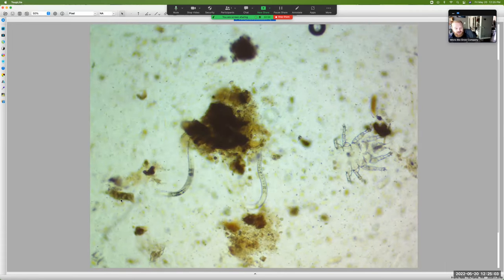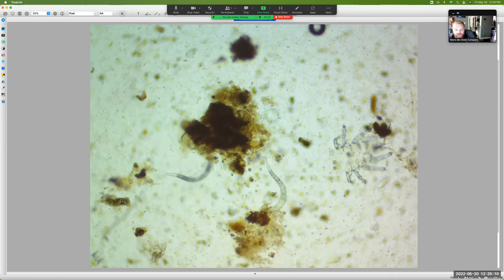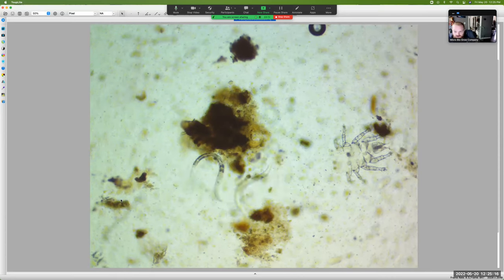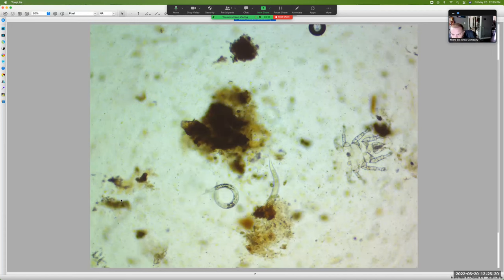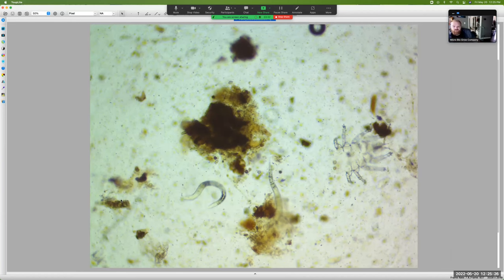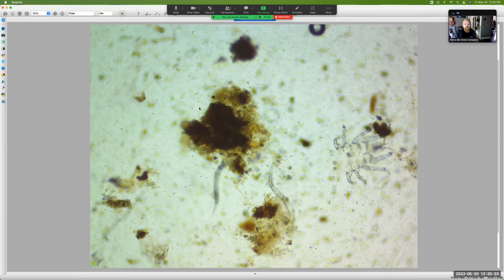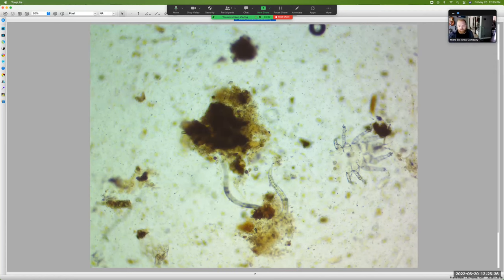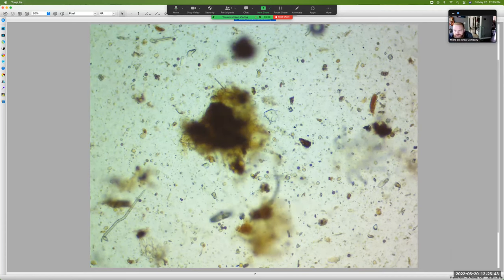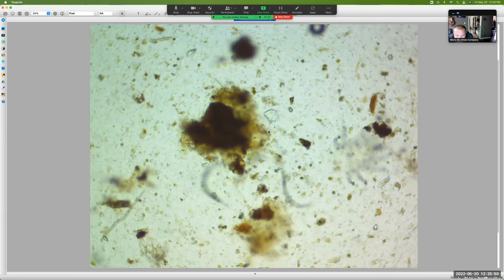This is why we like biologically complete compost — there's all sorts of fun stuff. We've got two live nematodes in the same shot and they are going crazy. I'm only at 100x right now. The color in this sample has that fulvic color — a lot of humic acid here. This is already a pretty exciting sample. If we keep drilling down it looks like there might be some test data over there too.